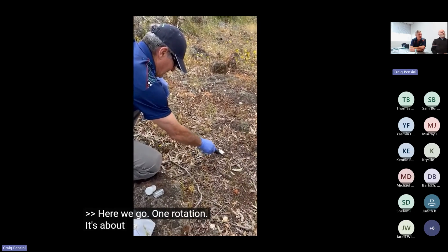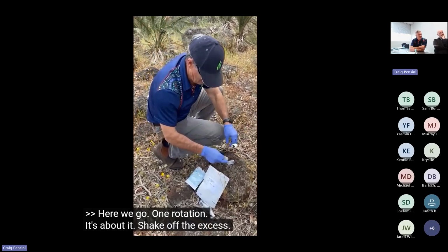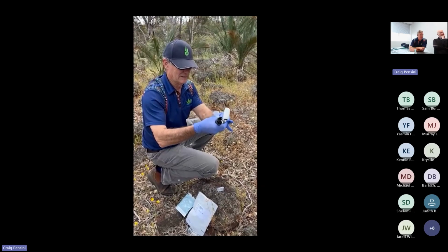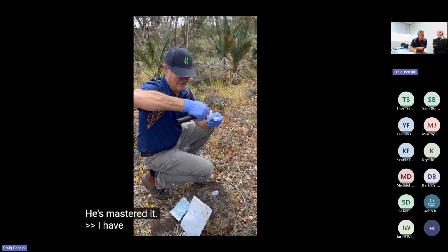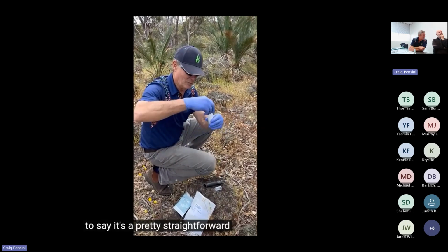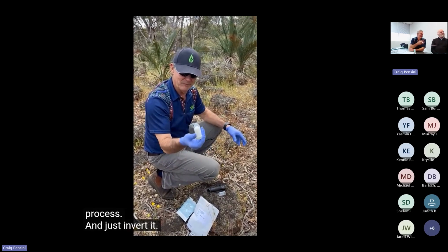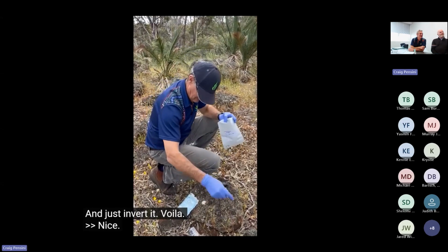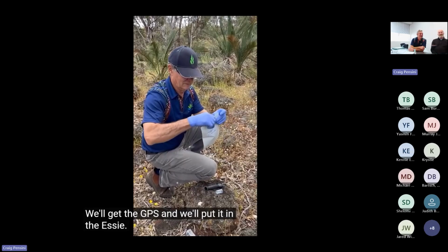Now, I'm going to give points or gold stars to people to work out what we could have done better. This is the very first kit we did. We did one roll, but what we should have been doing was multiple rolls in multiple areas, which is what we did as we went along and further read our instructions. But it at least gives you, in a short space of time, the ability to see how the kit is deployed. It's a good one, suitable for video. Yes, suitable for video, exactly.